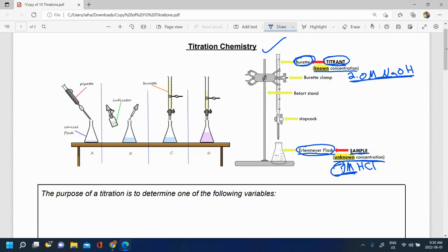So the burette allows you to be very precise. You can essentially add the substance drop by drop by drop, or you could add it as a longer stream if you want. But you can add drop by drop by drop so you can be as accurate and precise as possible.